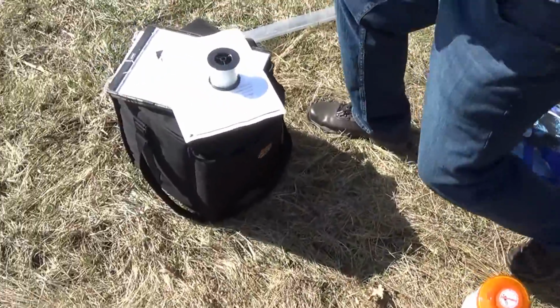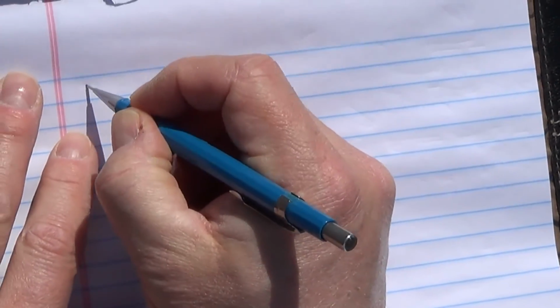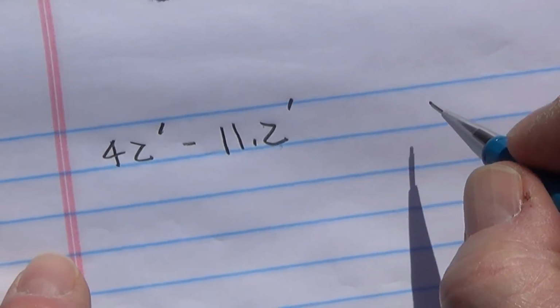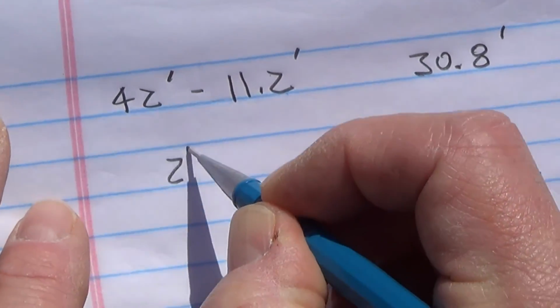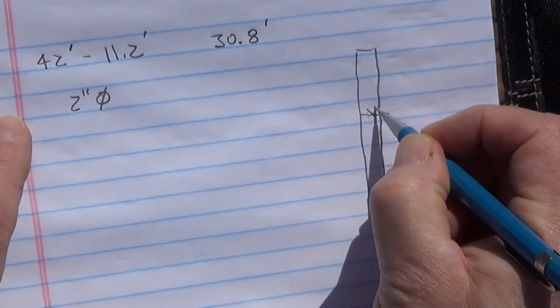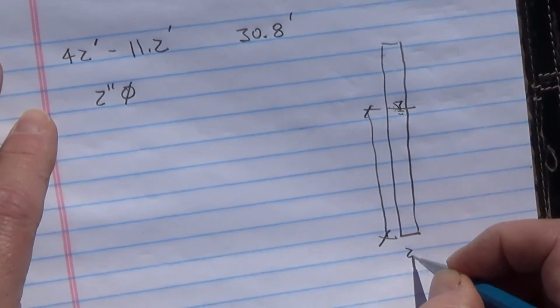So let me just show you that calculation. How much water is sitting in that well? Again, not technically groundwater, but surface water. And we know it's a 42-foot deep well, and the airspace above was about 11.2 feet, and so we have 30.8 feet of standing water in that well. I know it's a 2-inch diameter well casing, so we need to calculate what is the volume of water sitting in that well. Here's our water level. And we want to determine what volume is sitting in this 2-inch diameter.